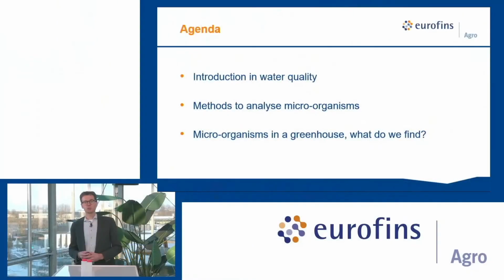First, I'd like to tell you more about water quality. What do we define with water quality? And I'd like to tell you more about the methods to analyze microorganisms. And where do we find the microorganisms in the greenhouse? What do we detect in the samples we receive in the laboratory?